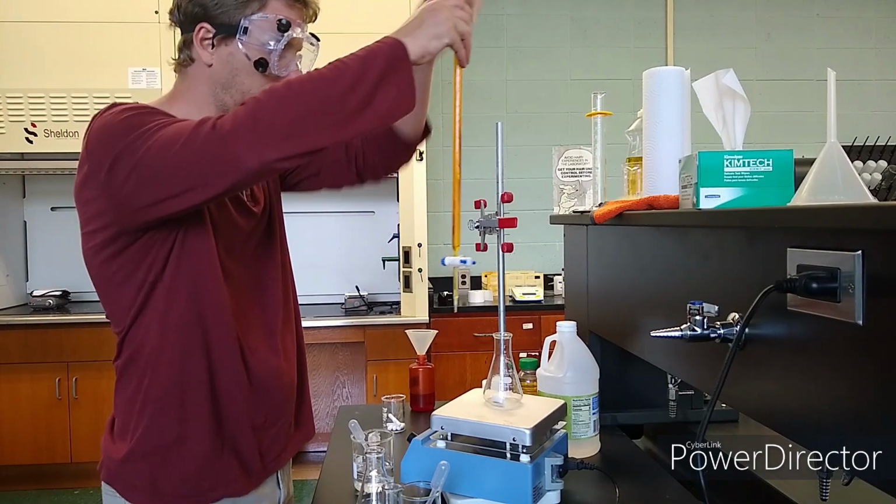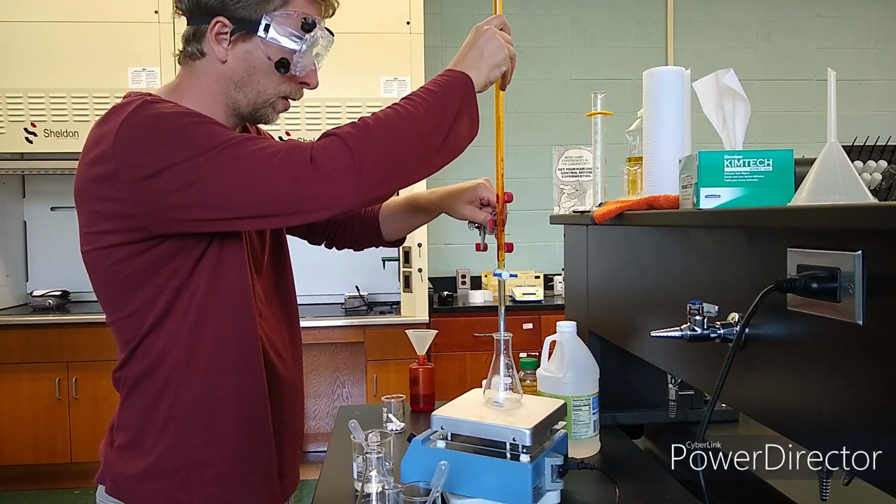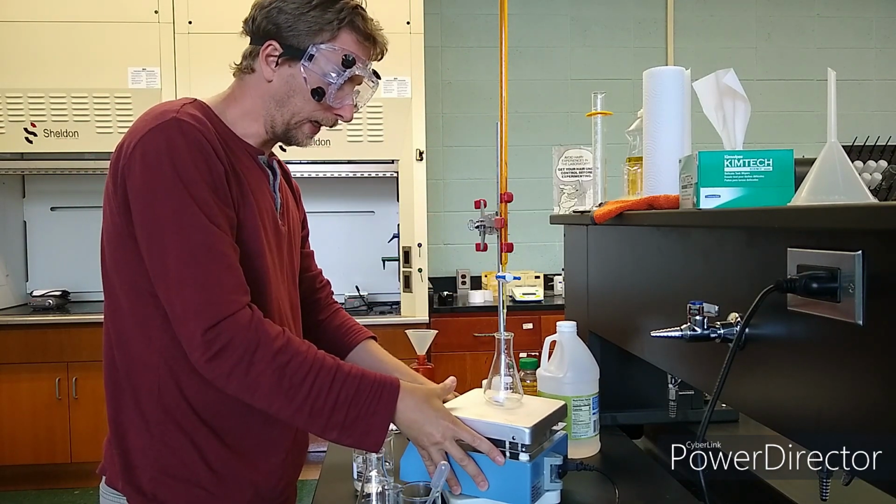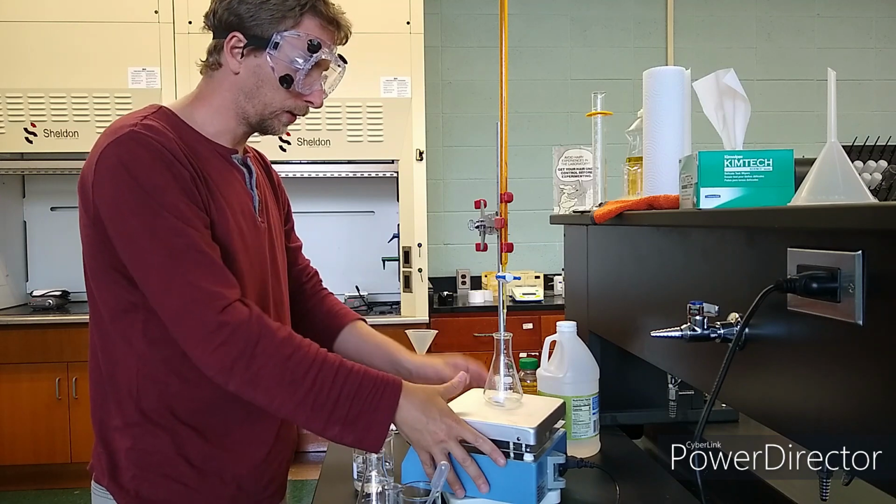Alright, now we put the burette in place right above the flask, and it's ready.